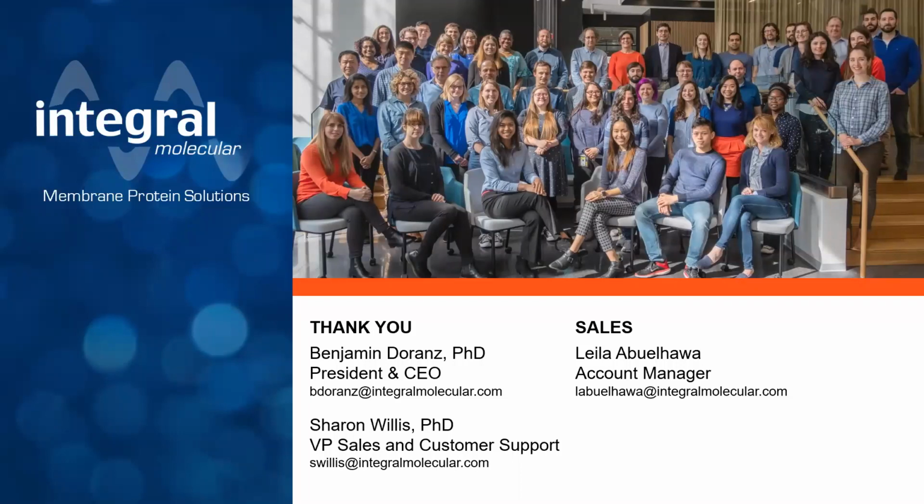Great. So what is the time course of infection? How long until you can see the result? You can read about 2 days after infection. We recommend 2 or 3 days, depending on the signal levels you like, and the signal to background and Z prime that you might need for statistical purposes. Basically, if your cells are plated, add the virus and the antibody if you like, whatever you're neutralizing, incubate for 2 or 3 days and read.